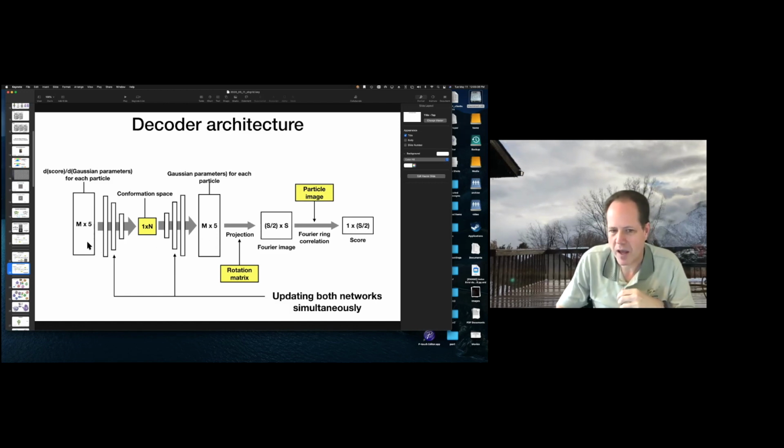If you have, say, 100,000 Gaussians or something like that, then these matrices become too big, and the GPU memory isn't capable of holding it, and it would be so computationally intensive right now, it just wouldn't be tenable. So once you reach a certain scale, we can't do it because we don't have the hardware to be able to do it yet.